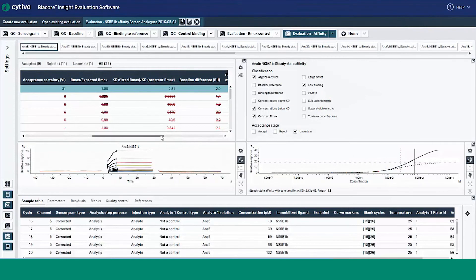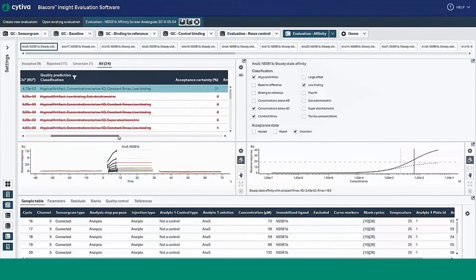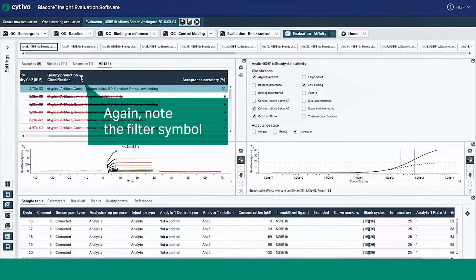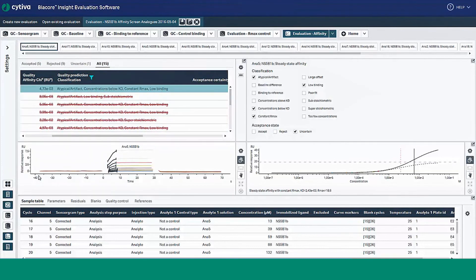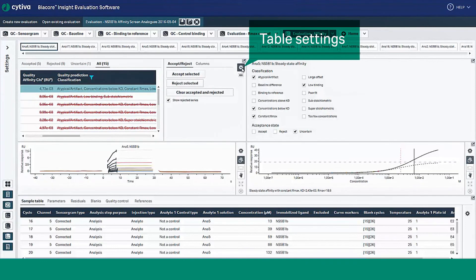If we go back to the table, note the filter symbol in the result table. This lets you filter by the desired quality prediction classification and focus on certain classification classes of interest. You can also customize the view of the result table by choosing the columns you want to include. Just select the column option under table settings to make your selection.